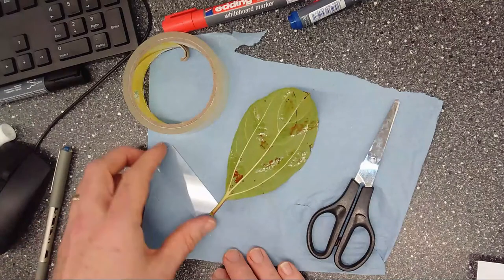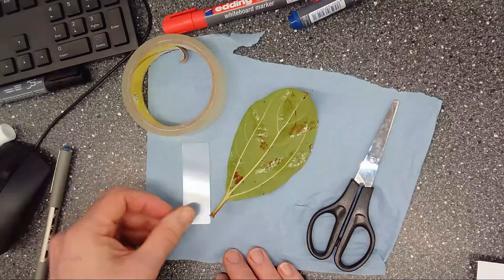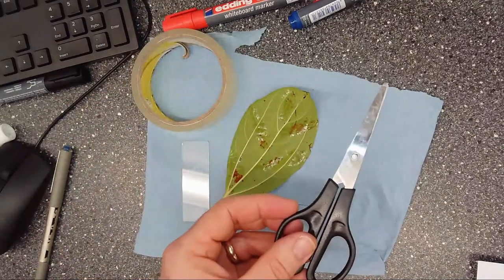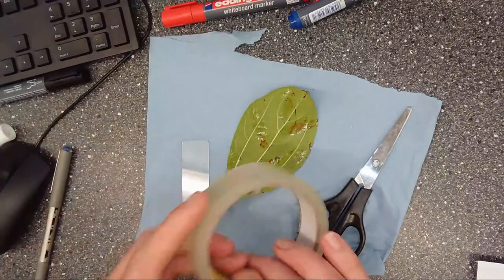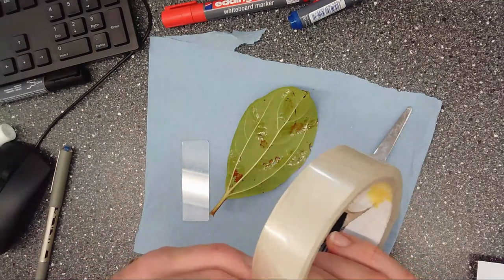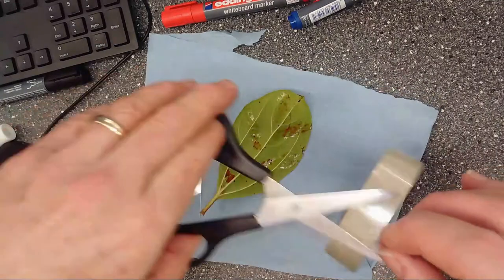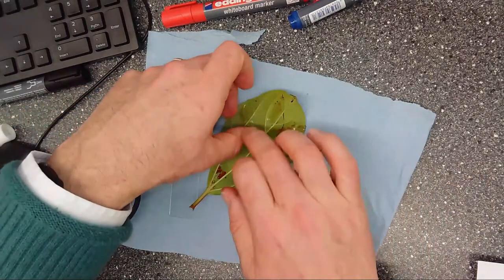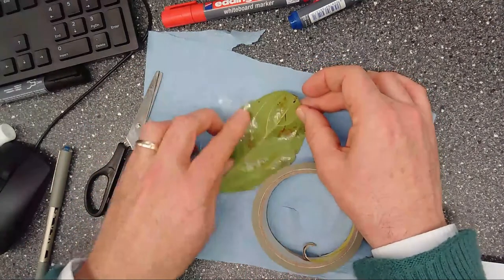Anyway, what we're going to do is what we call a stomatal print. You're going to need a glass slide, some sellotape, and scissors. We're going to take a print of the underside of the leaf. So we take a piece of sellotape, cut it, place it on one of the nail varnish bits like that, and press it down so it's nice and firm.